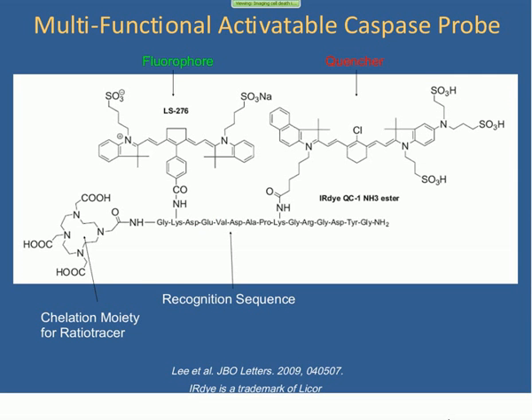Here you can see three concentrations, 5, 25, and 80 micromolar NMDA, and then subsequently injecting the probe and extracting the eyes for purposes of microscopy. There's no doubt that you can see apoptosis, and thus caspase activation, after NMDA treatment.